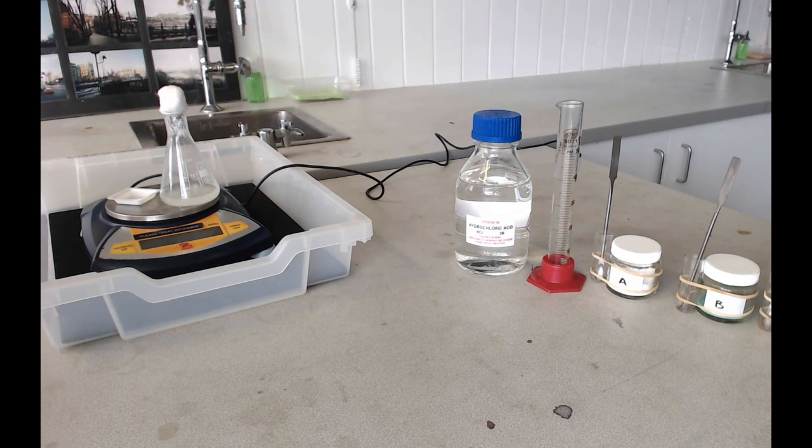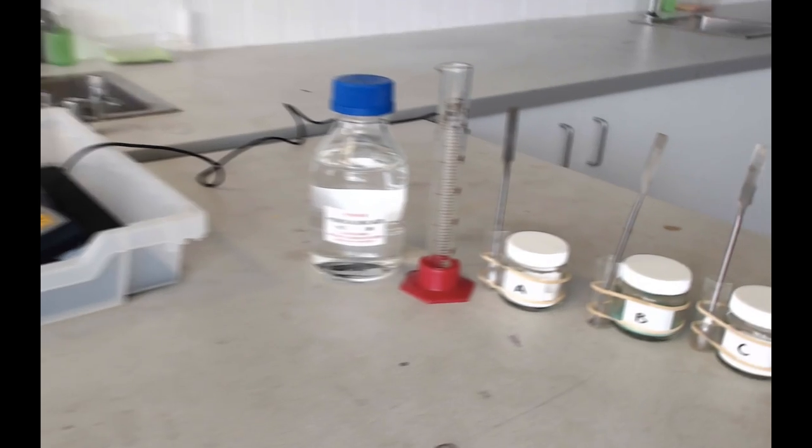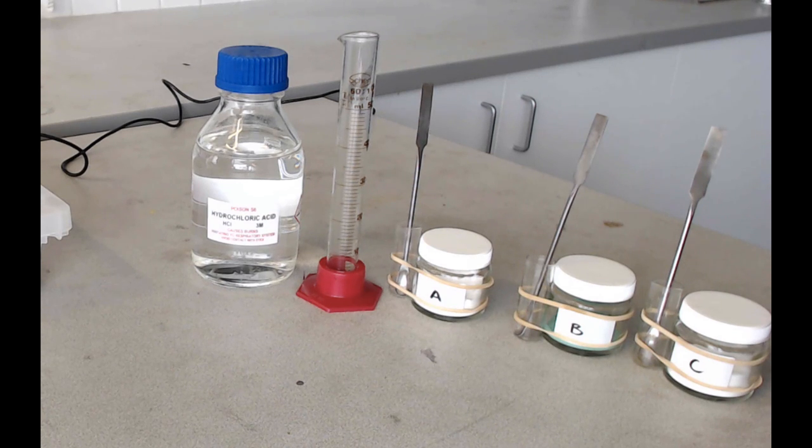Once you've carried out that procedure for one carbonate, you then just do it for the other two carbonates using a fresh 20 milliliters of acid each time. Everything that you've used today can just be poured down the sink.